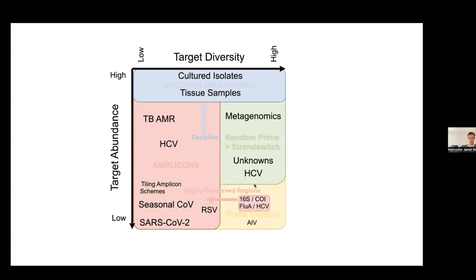I mean, these results, if, for example, we found a virus or a bacteria, can we say that these results are reliable, or do we need to go back and do the depletion, I mean, the wet lab depletion stuff? That's a very good question, and it sets up nicely something I'm going to talk about later on, which is quality control of sequencing results.